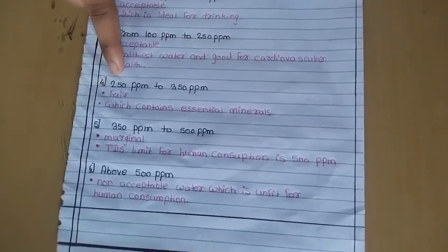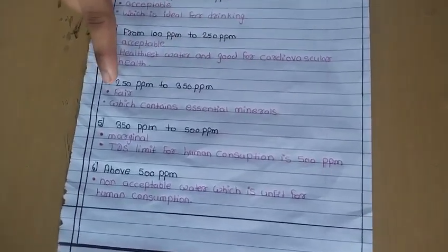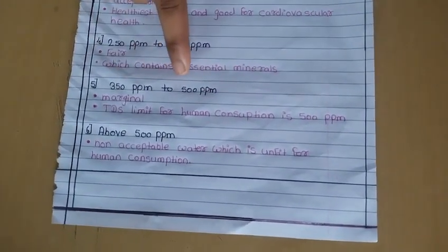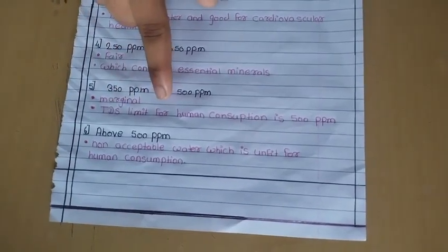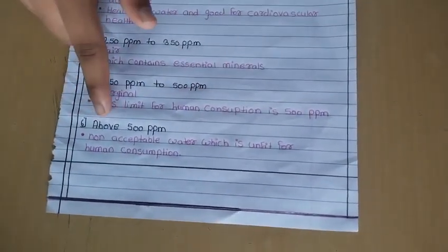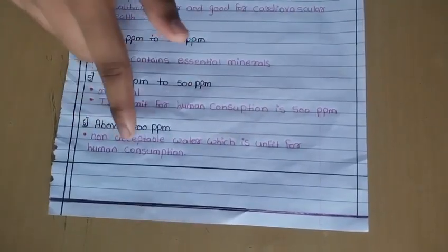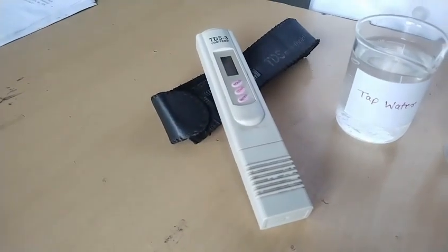The next one is 250 ppm to 350 ppm, which is fair and contains essential minerals. The next range is 350 ppm to 500 ppm, which is marginal, and the TDS limit for human consumption is 500 ppm. Above 500 ppm, that is not acceptable water, which is unfit for human consumption. In today's experiment, we are going to use a TDS meter.